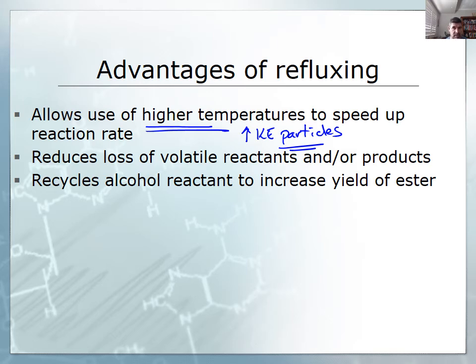So increasing the temperature increases the kinetic energy of the particles, meaning more of them are likely to have reached sufficient activation energy to react. The cycling of gases through our reflux reduces the loss of the volatile reactants and also reduces the losses of the products, and allows us to recycle some of those reactants in order to try and increase the yield of the ester.